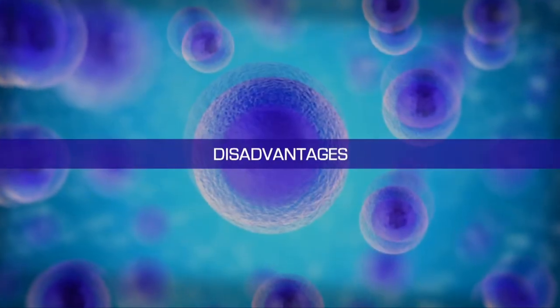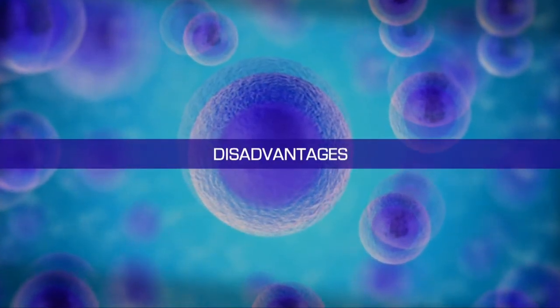However, the disadvantages are: cell counting requires a hemocytometer and hence counting errors can occur. Poor handling resulting in poor dispersion of cells can result in miscalculation of the number of cells. The use of a hemocytometer also warrants handling errors such as improper filling of the chamber, presence of air bubbles, as well as inaccurate dilution of cells.